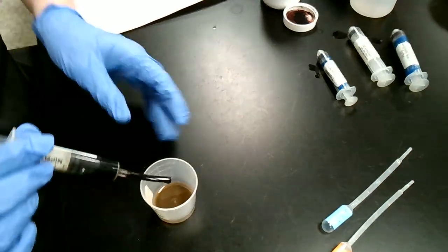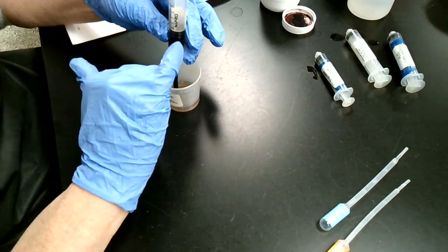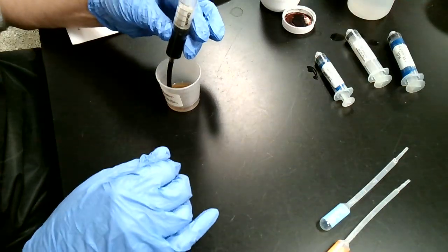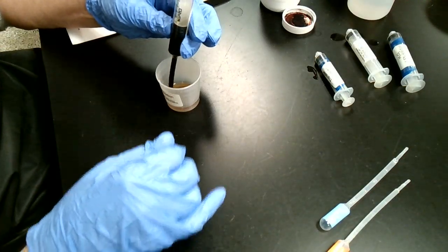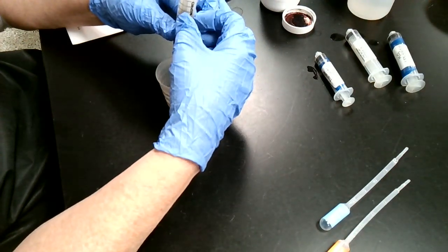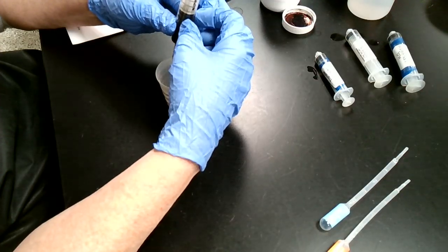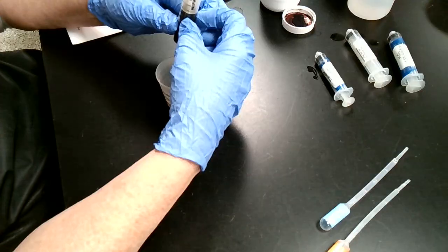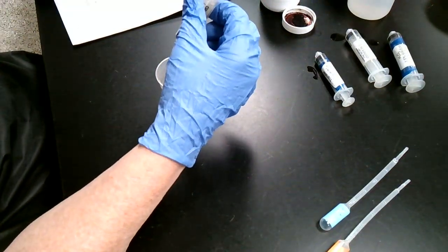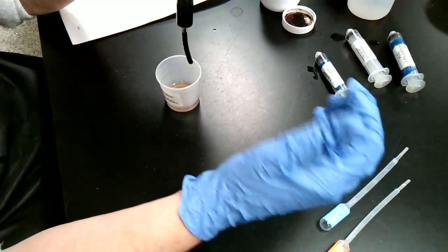Okay, so now I'm just going to look at my final volume, which my initial volume was 5. Ooh, excuse me, my initial volume was not 5. Okay, so Mrs. Horner is messing up a little bit here. My initial volume was 7. And now my volume is 6.5. Okay, so I put my initial volume at 7, not 5. My bad, you guys. Oh, gosh. Duh. Okay, you guys, I just had a dumb moment here.